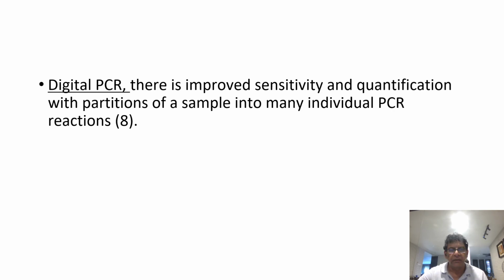What are the emerging and advanced techniques currently? One of them is digital PCR. There's an improvement in sensitivity and quantification with partitions of samples into many individual PCR reactions. I'd like to show you an example of this.